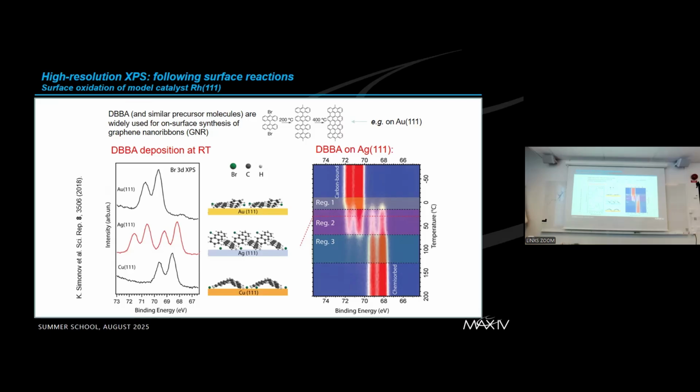So essentially, XPS always relies on the fact that we have no magnetic fields in the area above the sample. That's why people even try to use special anti-magnetic metals for screening the internal part of the vacuum vessels from Earth magnetic fields or whatever magnetic fields. So maybe it's a good idea, but it's difficult to detect.